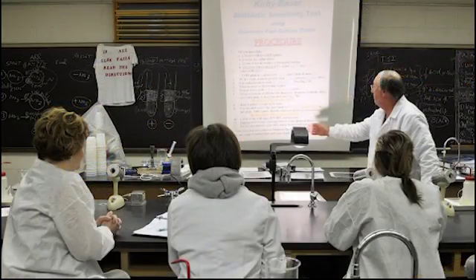Rule number 8. This rule states that you must not begin any work until you have received instructions. Make sure that you have read over the exercise and are sure that you understand the procedures. Ask questions when you don't understand the method or purpose of an experiment.